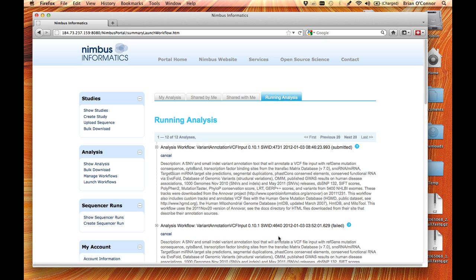What's nice about this is this will tell you what's going on. It'll tell you the status. Is it running on EC2? Is it running on the cloud? Has it failed? If you do run into a situation where you have a failure, you can email the help desk at help@nimbusinformatics.com and just provide us this SWID number. That's our tracking number that will allow us to tell you exactly what's going on with this workflow.